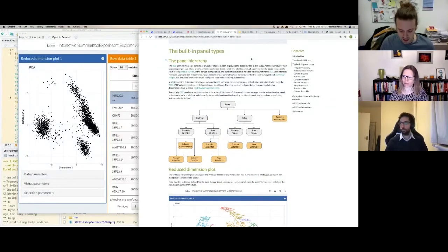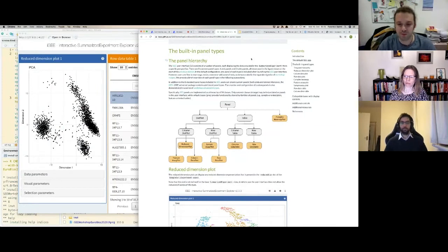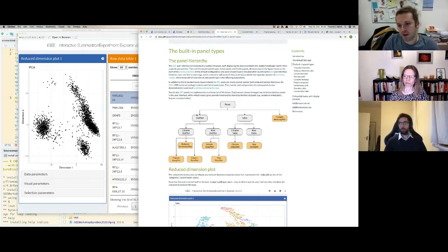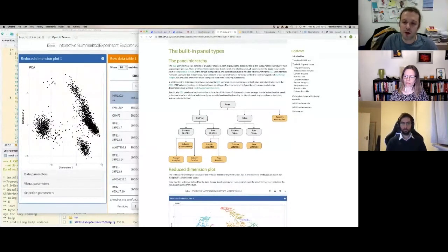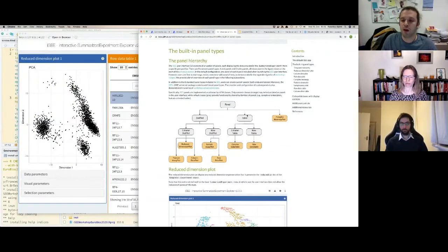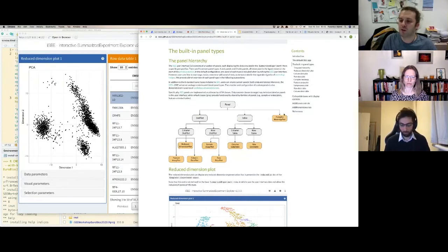In iSEE you have several built-in panel types that cover most operations you'd want to do with your dataset. They are structured in a hierarchical way, exploiting the inheritance to avoid redefining panels from scratch. You have dot plots (column dot plots or row dot plots), tables, and something that brings rows and columns together — a ComplexHeatmap plot.